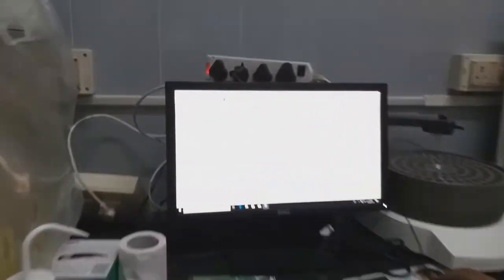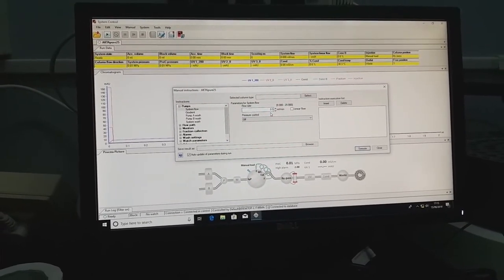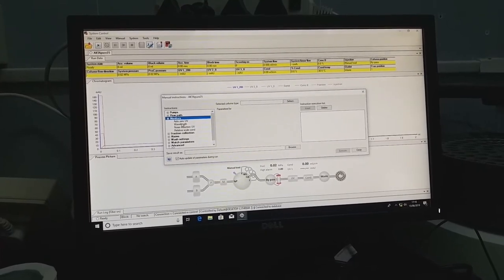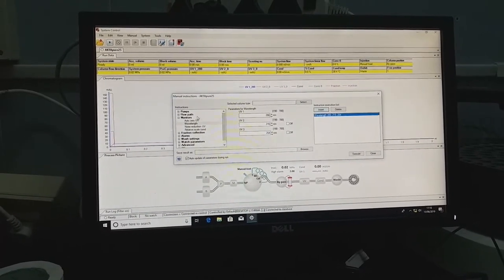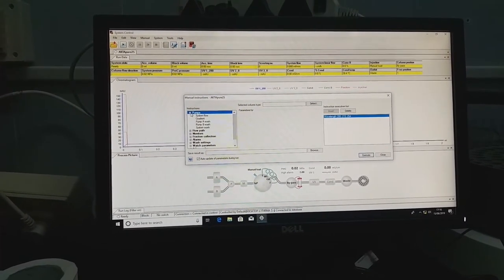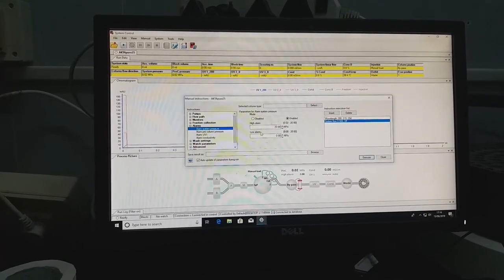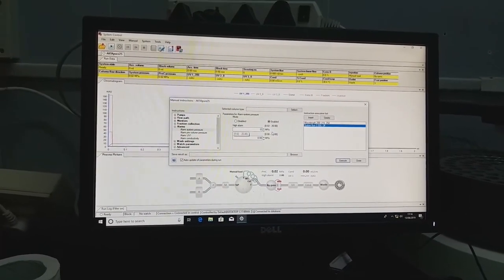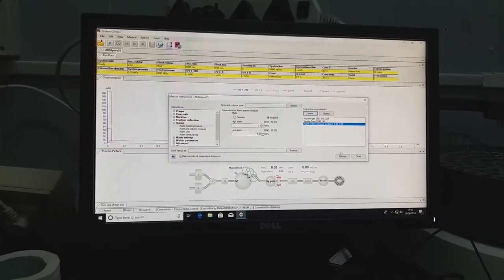Before connecting the column we need to adjust a few parameters. In the software, set the system flow to 0.5 ml per minute since we are going to connect the column — if the flow rate is more, a pressure alarm may trigger. After that, we also have to set the monitors and set the pressure alarm threshold. I am keeping 0.8 MPa. Once done, insert then execute the command.